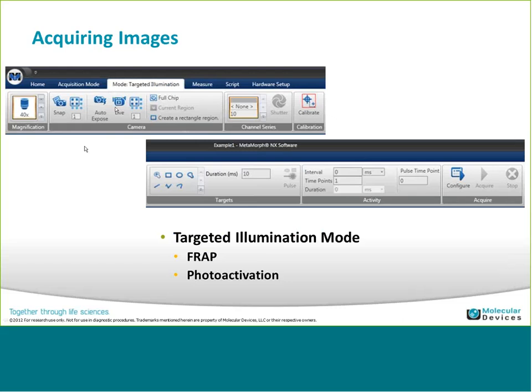So let me switch over to Metamorph NX and we'll work through the different modes of acquisition that we have here. The one I didn't point out yet in the PowerPoint, but we'll cover, is our image interactive mode, because the interactive mode is the basic mode of operation. So you're manually moving the stage around to a new field of view. You can do multiple wavelengths, but you're not going to be doing multiple time points or multiple Z positions, and you're manually selecting your field of view in this case. So it's more of a survey type of general approach for doing basic imaging.